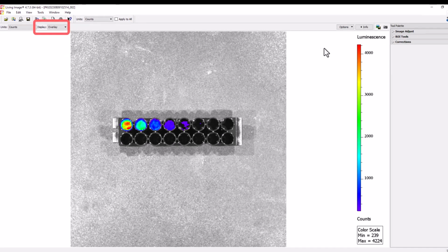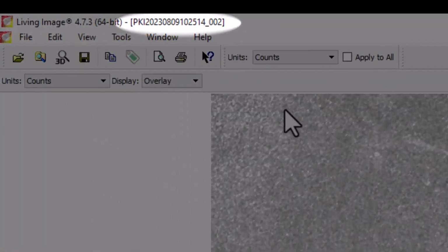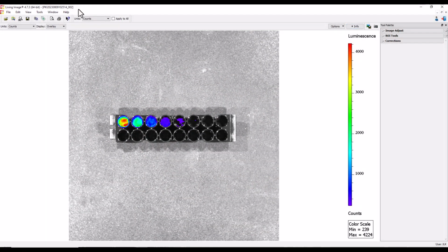Each image window has its own unique image or click number that you can see in the header bar in the upper left-hand portion of the window. This number consists of the user ID followed by a date timestamp for single image acquisitions. Important acquisition and identification labels can be visualized by selecting the appropriate button or pull down from within the window itself.